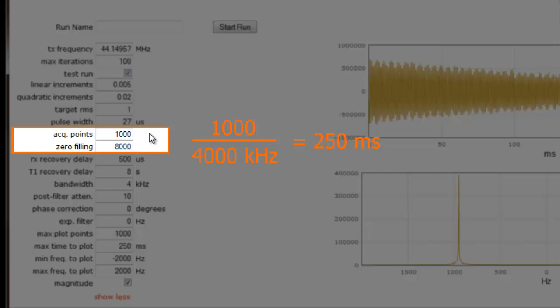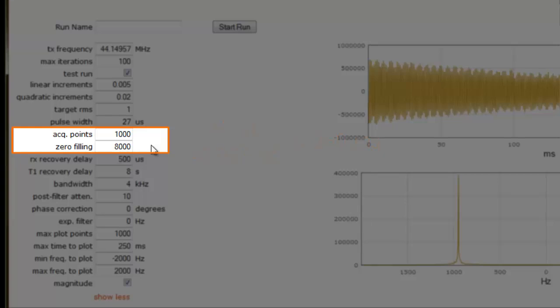With a 4 kHz bandwidth, we can acquire up to 4000 points. For shimming, we collect 1000 points. Zero filling helps get rid of digital artifacts, improve spectral resolution and line shape, and ensures that we're evaluating the true signal intensity. For shimming, we zero fill our data up to 8000 points.